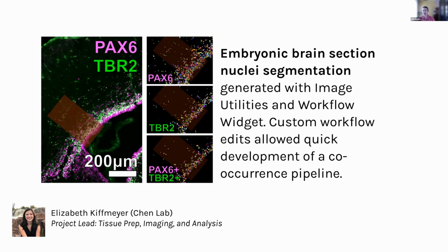They're very odd. So we can put that in the right direction, and then we use the workflow to batch process this on hundreds of images. These images are relatively small, maybe about 10 megabytes, and we can process 100 images in less than a minute. So we're really powering up that workflow, which means that if you've designed your pipeline, your next experiment with 100 images, you've already got all of that data in just a few minutes.